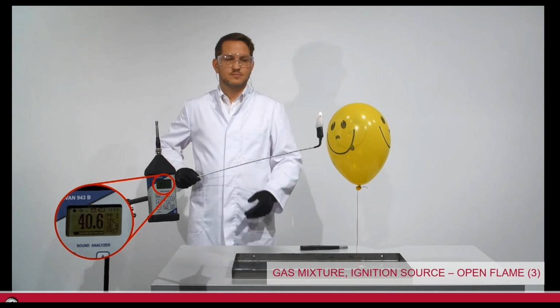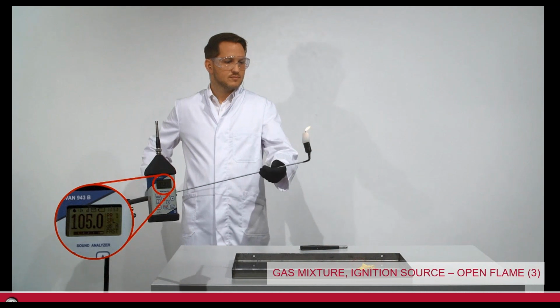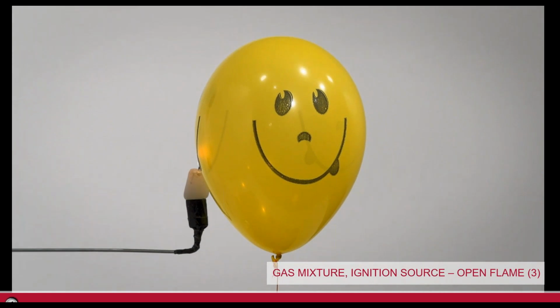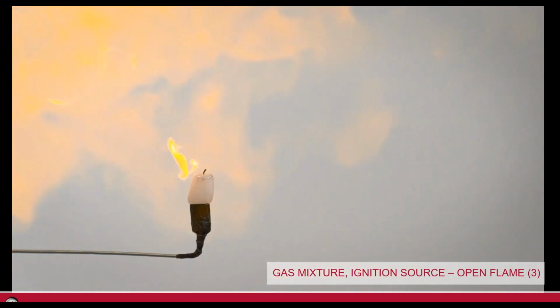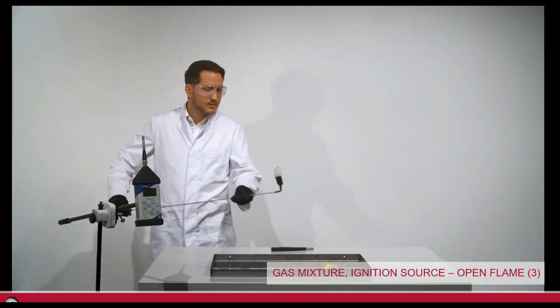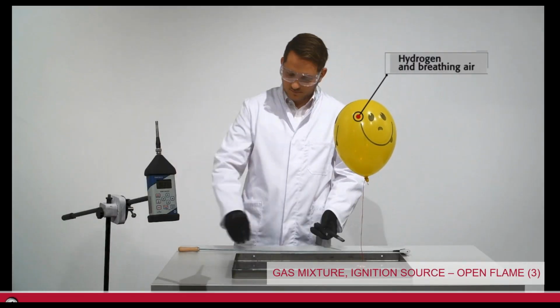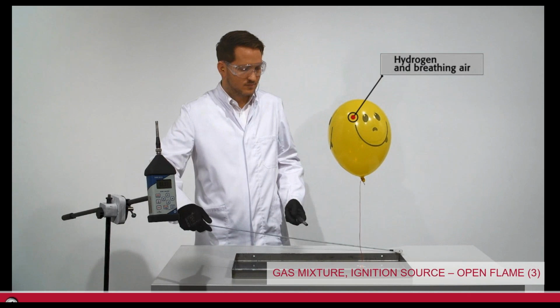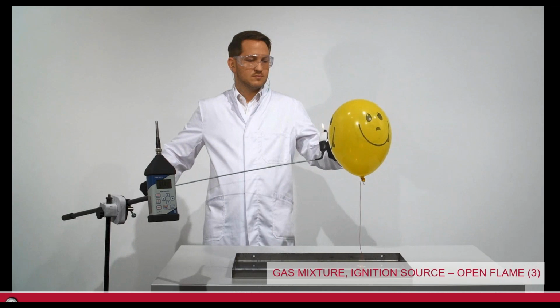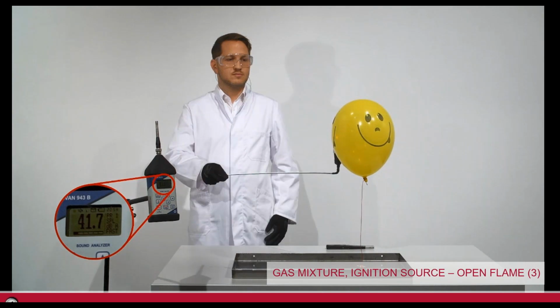Also, just for fun, pay attention to the sound meter. So initially, just a little bit of hydrogen, which we know hydrogen is pretty explosive. I'll show you later on that anywhere between 5 and 75% of a ratio of hydrogen in the air becomes explosive just under a little bit of an open flame. So now we'll just add a little bit of breathing air. The scenario of this is an experiment that off gases hydrogen, or just a simple compressed air cylinder that's got a leak.